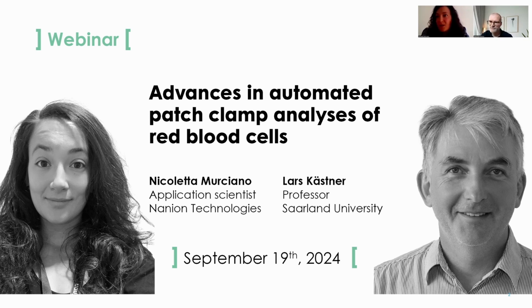So thinking about, as Lars said, having less than 5 copies per cell, not sure if it's 100% functional, because we don't have to forget that red blood cells with aging lack protein translation. So probably channels can also be not functional anymore. So maybe it is the case that Gardos was not really activated with the influx of calcium via Piezo and via Piezo1. So this can be one of the explanations.